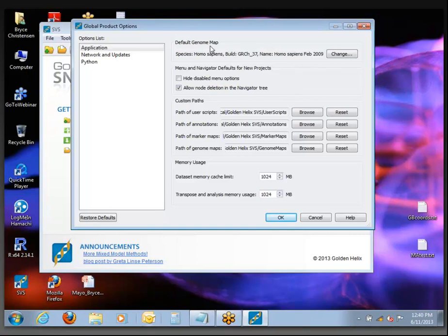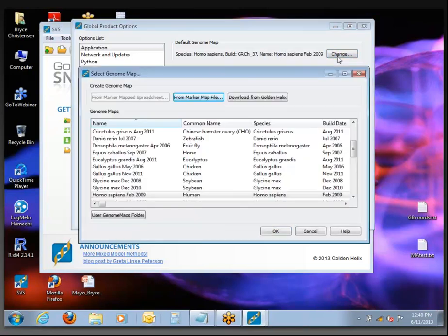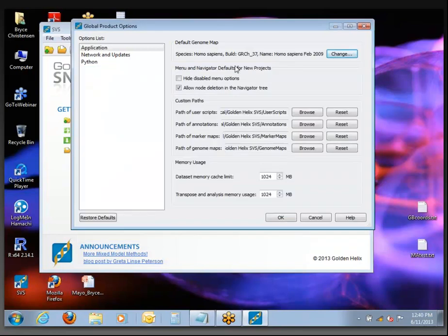This top one, default genome map, is an important one to be aware of. If you are working mostly with human data, probably the default setting for GRCh37 is correct.